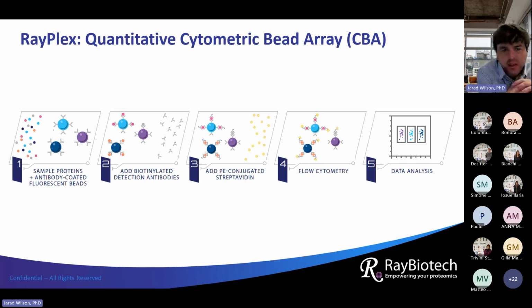So the RayPlex arrays are designed, again, around the cytometric bead array approach. We have individual populations of paramagnetic beads. Well, they can be paramagnetic. They're not always. I'll get into that.